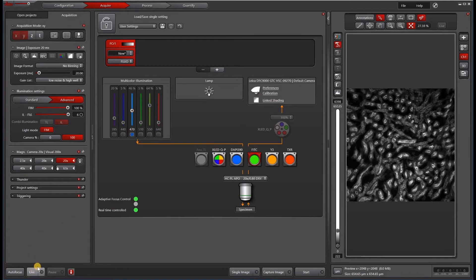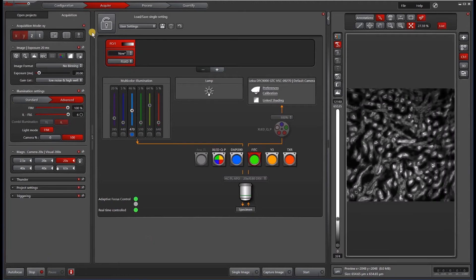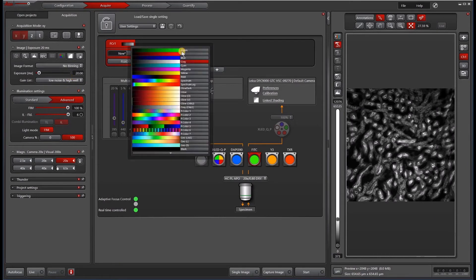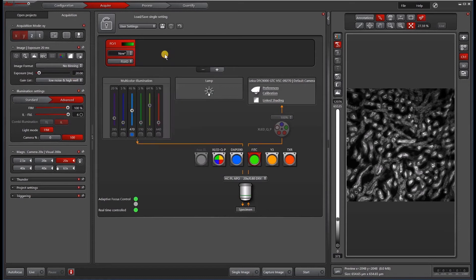Then let's go live, focus. And then from here, we would want to play with our exposure as we would normally. The last thing you might want to do is change this color to green, for example.